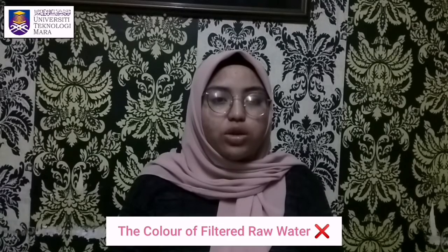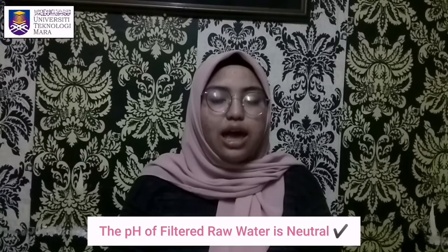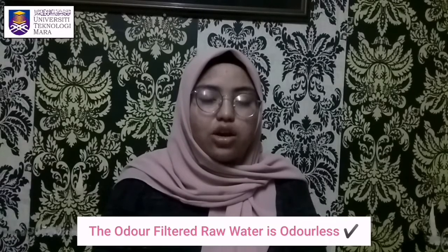All the results have been compared with WHO. According to them, the drinking water should be colorless, and result of this project showing that the water sample did not change into the colorless. Then, the pH value for the normal drinking water should be in between 6.5 to 8.5. The water that consists of pH that more than 8.5 is because the water that has high concentration of magnesium and calcium that are not good for health. Lastly, the odor of the water should be odorless. The water sample is showing that they are odorless.